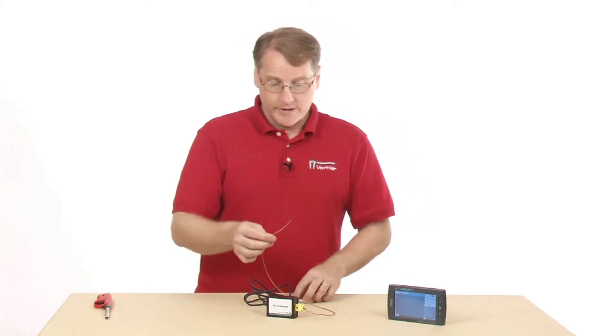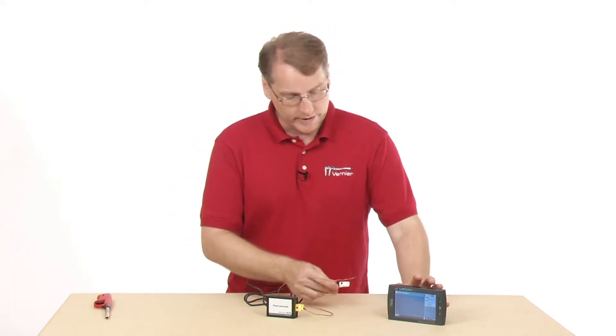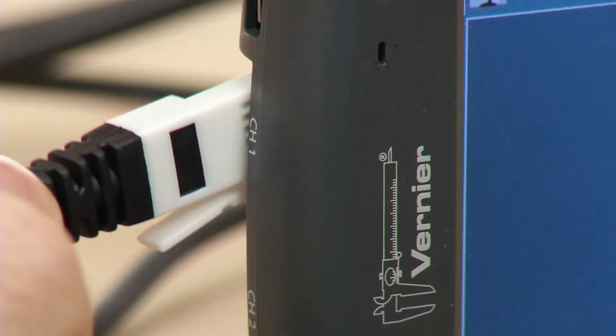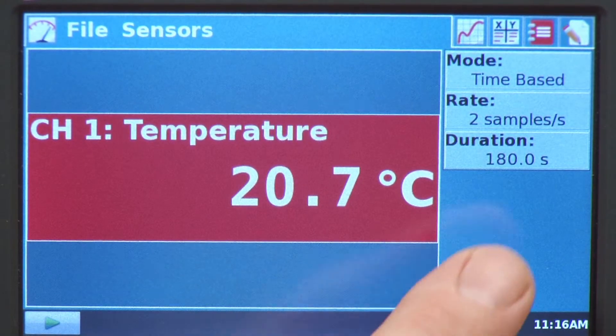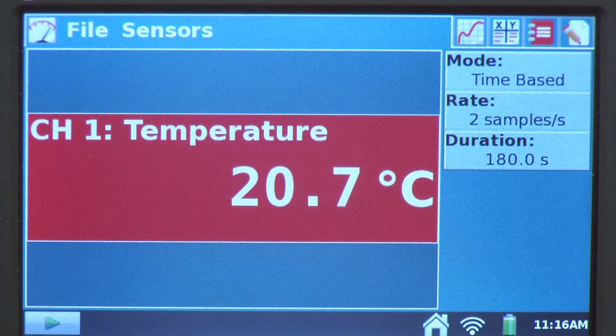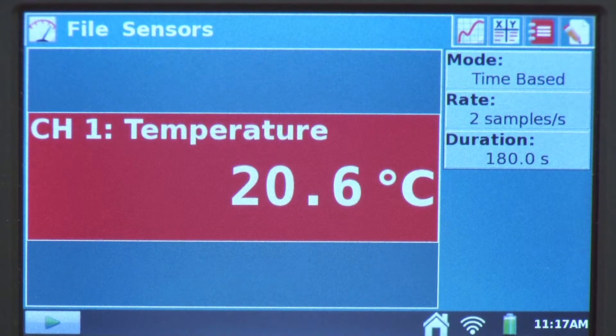Let's collect some data. It's an analog sensor, so I need to plug it into one of the analog ports, like channel 1. We can see our meter reading there. In the upper right corner of the screen, we see the default collection parameters, which is time-based — two samples per second, 180 seconds. This is the same setting you would find with any of our temperature sensors or probes. They all default to a three-minute time graph.